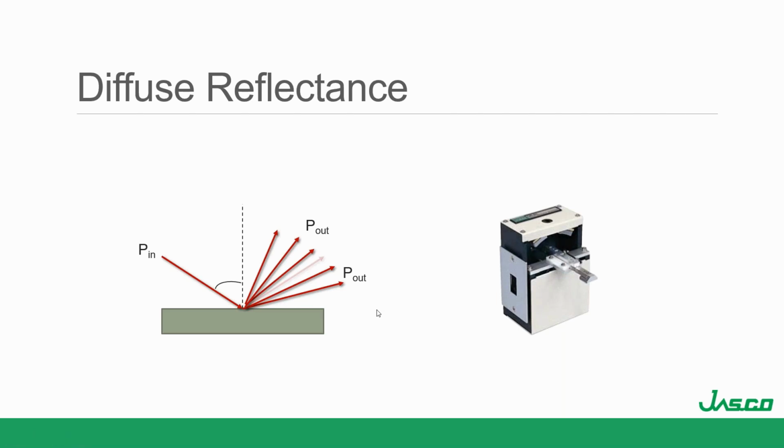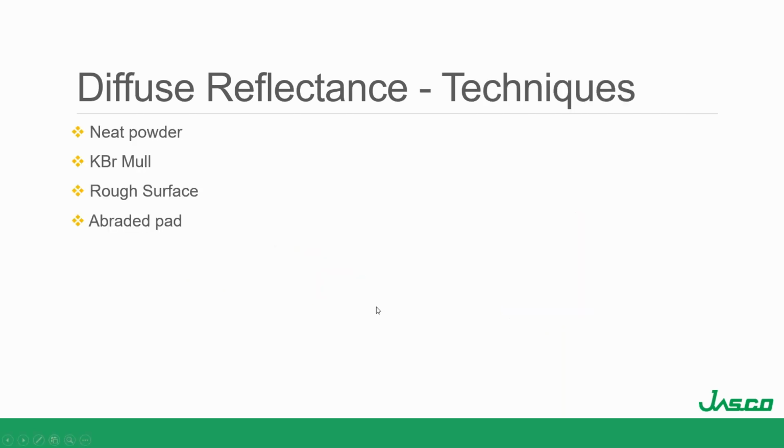And this is good for neat powders. Not all neat powders will work. If it's too strongly absorbing, you're not going to get any signal. If it's something that's weakly absorbing, like soil, you can get good spectra off of it. The other option, if it absorbs too much, is much like when we talked about making a KBr pellet. You make a mixture where you put 3% in KBr and mix it really well, and then you put it in and do the experiment.